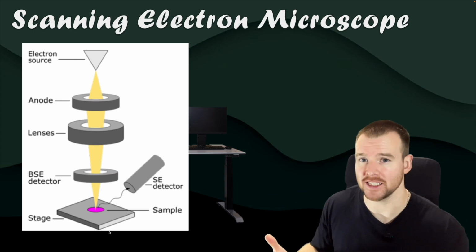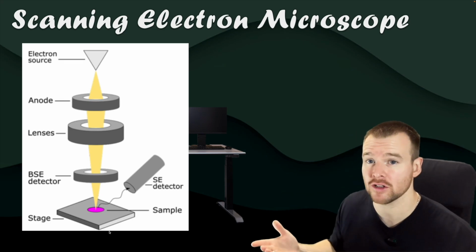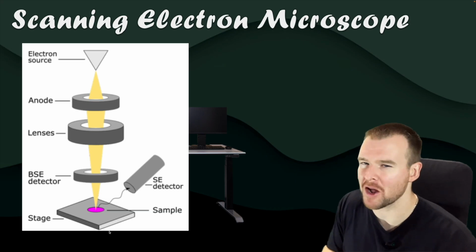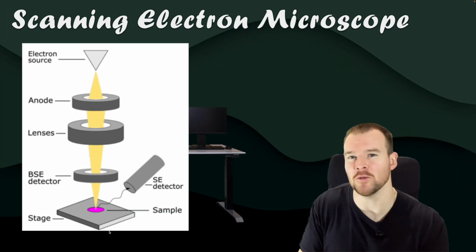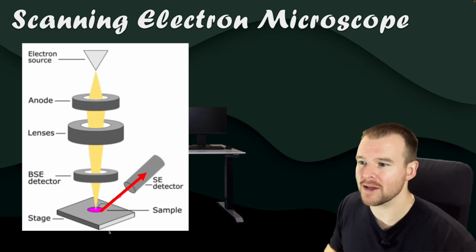They're going to get ejected. You can knock off electrons from the specimen, and there can be bouncing off of the original electrons you shot. There's a bunch of electrons coming off. But for simplicity, at this grade 10 level, we'll say they're just being ejected or bounced off. Okay, so they're being bounced off like this.